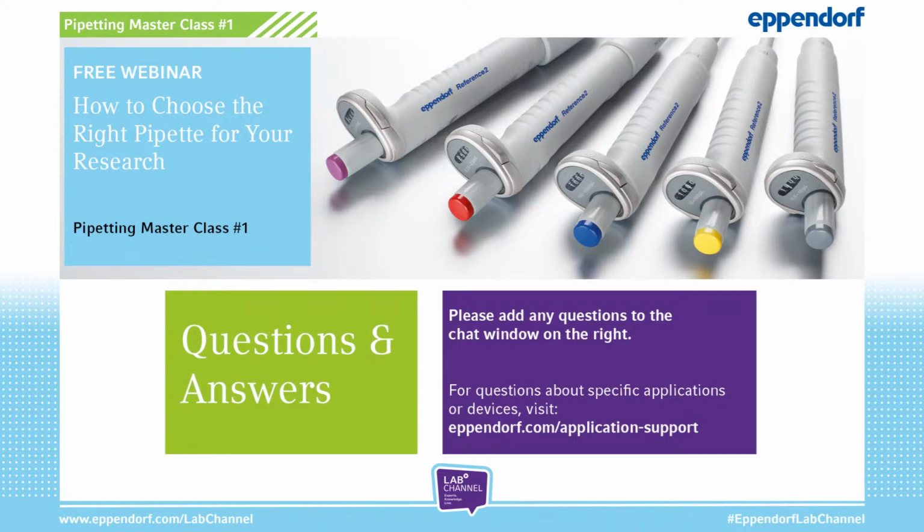And in general, an electronic pipette or dispenser can eliminate, of course, a lot of variance from pipetting and also pipetting between different users.